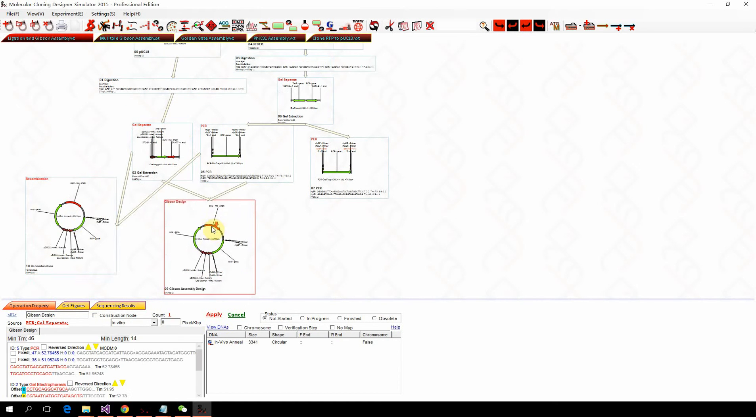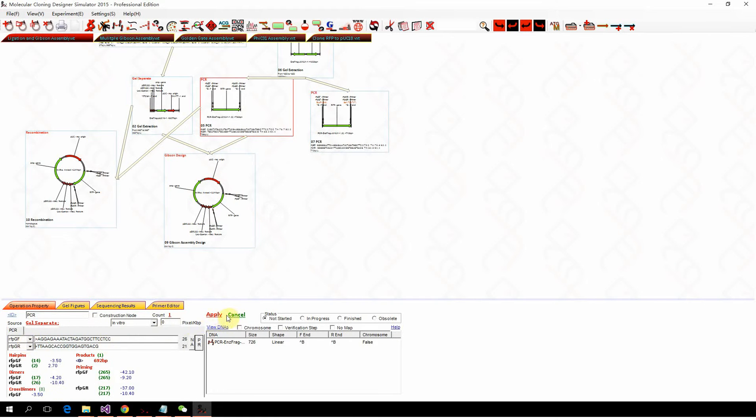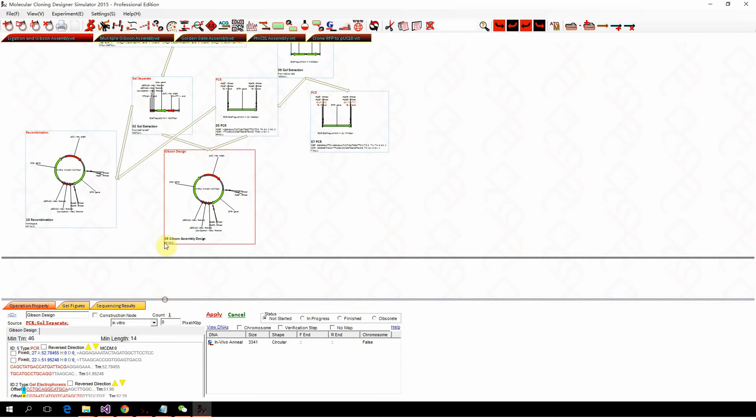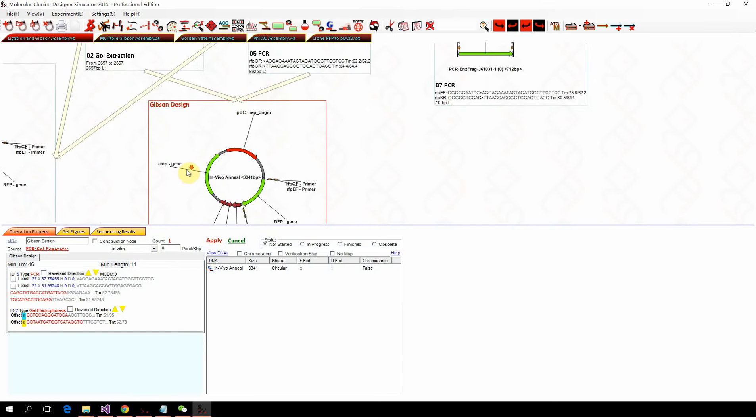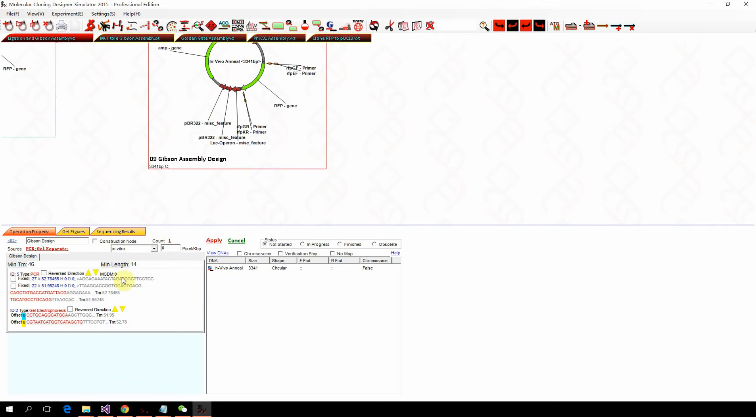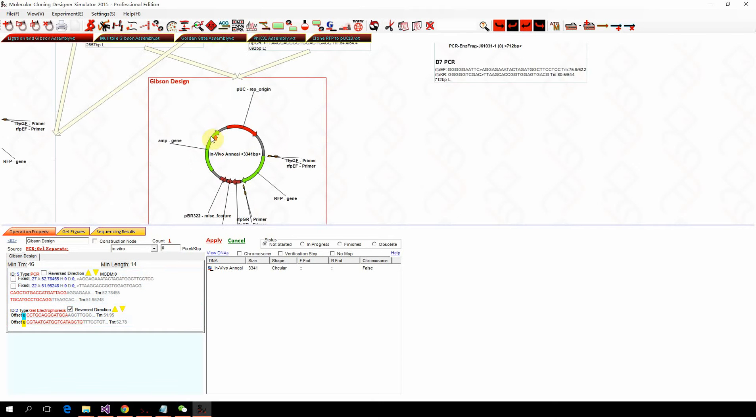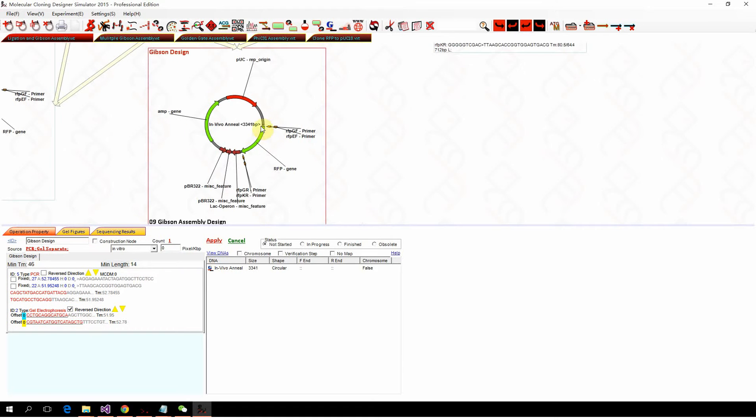If you want to control the Gibson assembly direction, we first remove the annealing sequence from the primer. Back to the Gibson assembly design node, we can reverse either the fragment, the plasmid backbone, or the fragment. Be careful now that the RFP and the pUC replication are in the same direction.